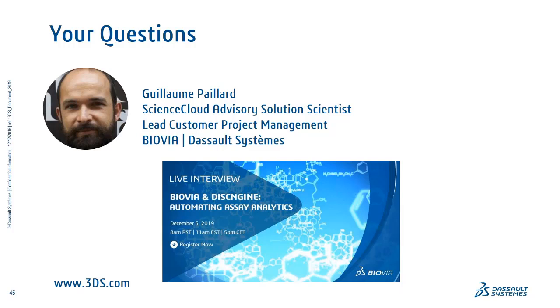So the list I've shown at the very start of the presentation is the one for which we're providing out of the box functionality. What I mean by that is out of the box normalization, visualization, sample analysis, and sample analysis visualization. But first of all, that list is evolving over time.